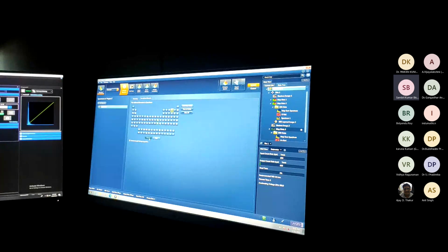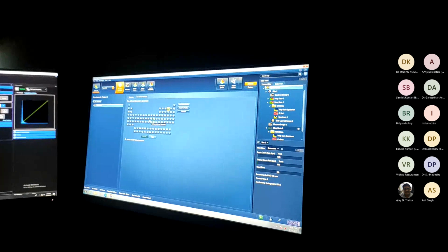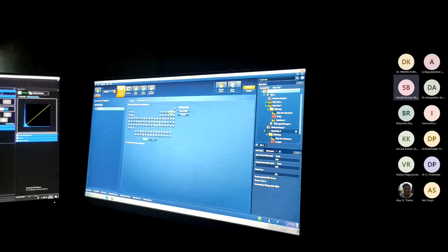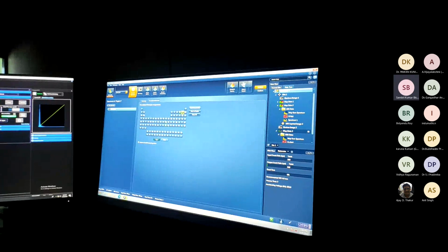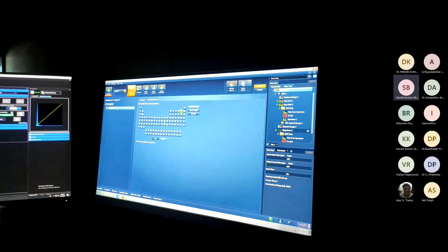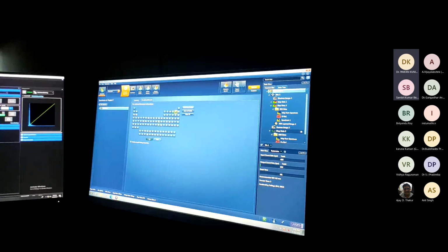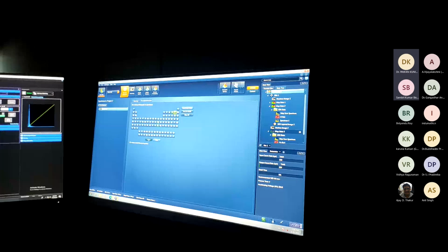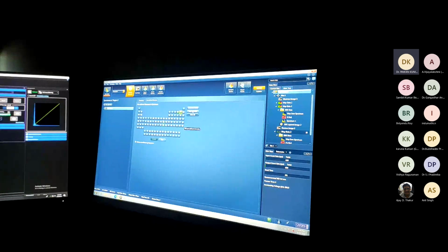Oxygen, obviously, will form the oxide, and chlorine and some bit. That's it. So copper is also present. Carbon is also present. The grid is made of copper, so we will get the copper, a trace of the copper and the carbon as well. The film is carbon, so we are not interested in that one.